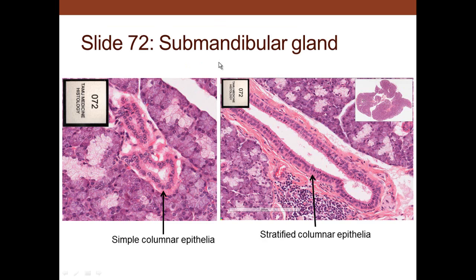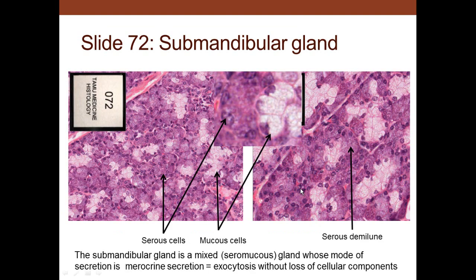The submandibular gland, one of the salivary glands, shows simple columnar epithelium as part of its duct, and as the duct gets more complex, it becomes stratified columnar — more than one layer with columnar cells on the surface. Looking at the glandular portion, you can see both a serous and a mucus component. Sometimes serous and mucus are found together, where the serous is on the outside of the mucus component — this is called a serous demilune. This gland is a mixed serous-mucus gland.